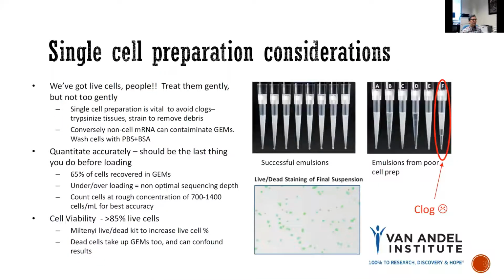The first problem we will encounter in your real single-cell experiment is single-cell preparation. There are technical considerations. How are you going to dissociate your cells and make them separable and captured by the partitioning oil droplet?